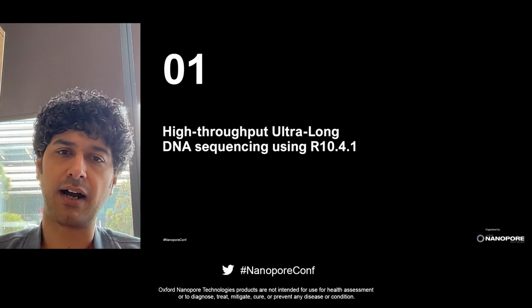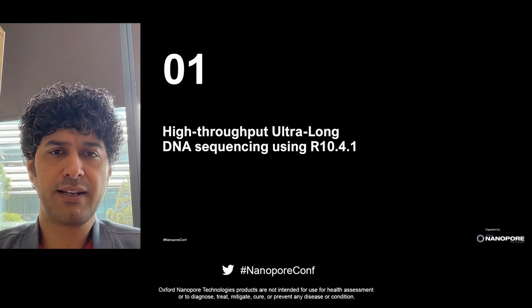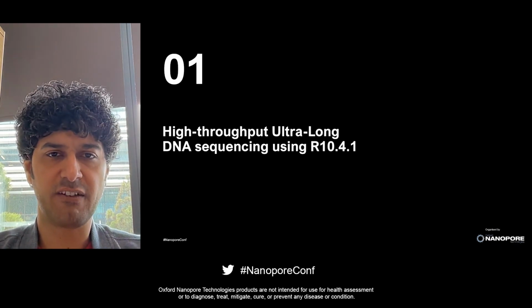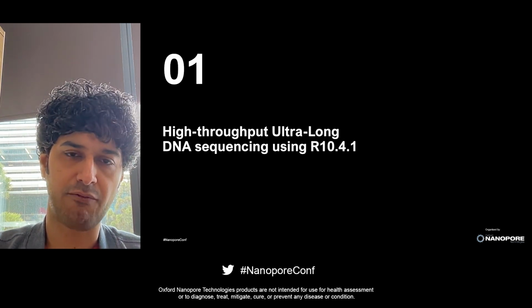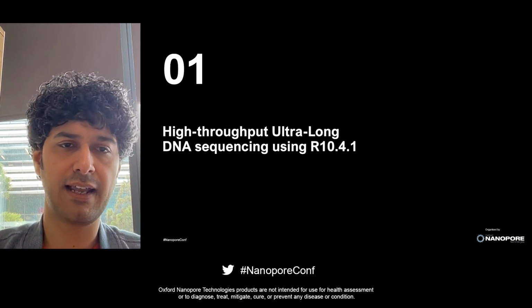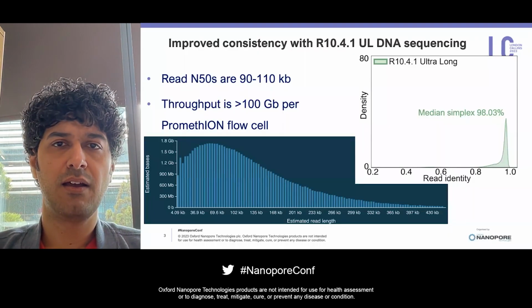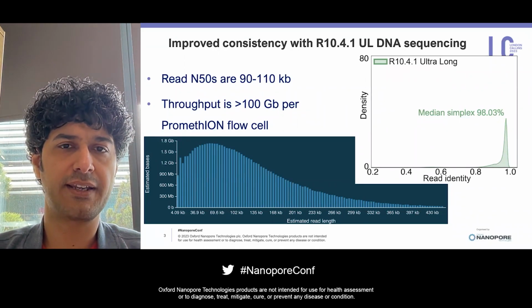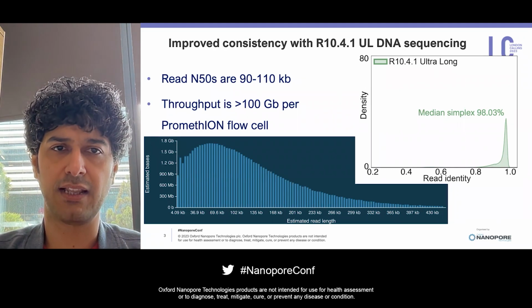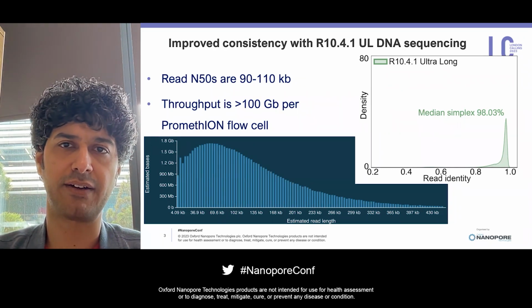First, let's talk about R10.4.1 ultra-long DNA sequencing. This has been around in the field for about a year. We have been piloting this from early access up until recently and been very impressed with the performance of the kit, and the throughput has improved over time. More recently, we consistently are able to get over 100 gigabases per PromethION flow cell with read N50s for these experiments ranging upwards of 100 kb.